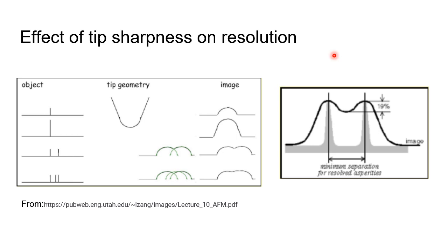due to technological constraints. The geometry of the tip can also affect the image, as for example, a spherical or blunt tip can have a hard time distinguishing edges of the sample. This is also a problem with a tip that wears out after long scanning, as the tip can become blunt after it experiences too much frictional force through dragging on the surface.